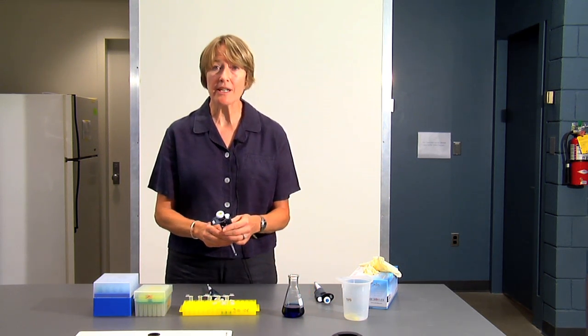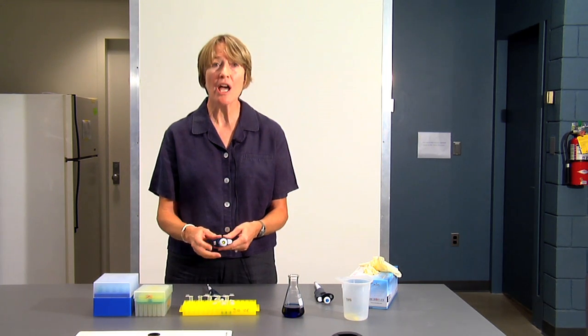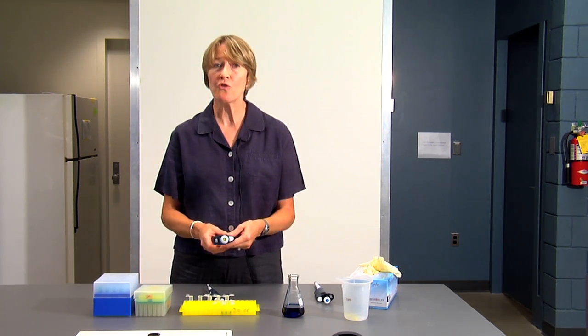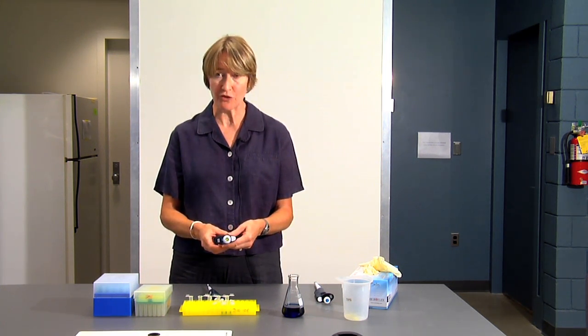We'll also be using a P200. Again, P200 is listed on the top of the plunger. P200s are used for measuring 20 microliters to 200 microliters of fluid.